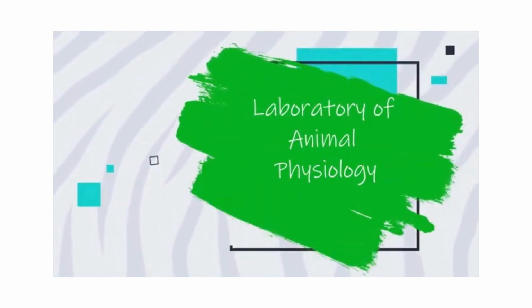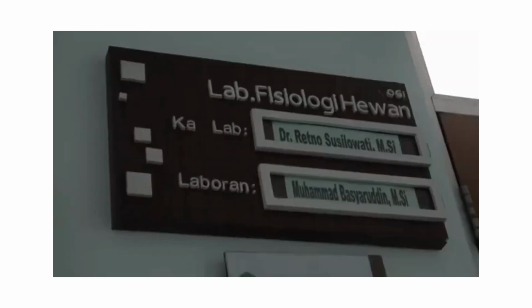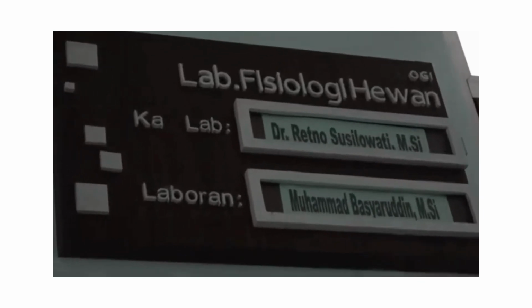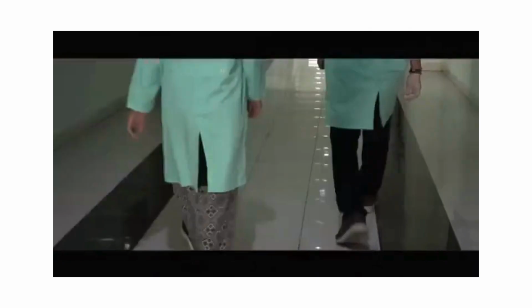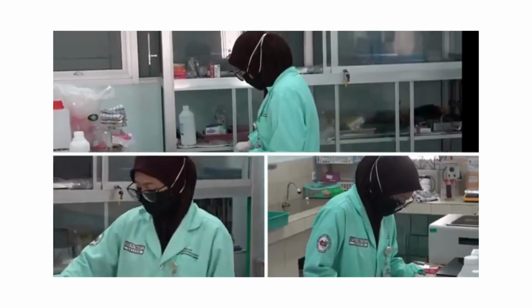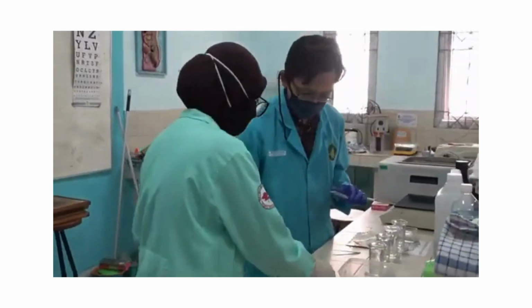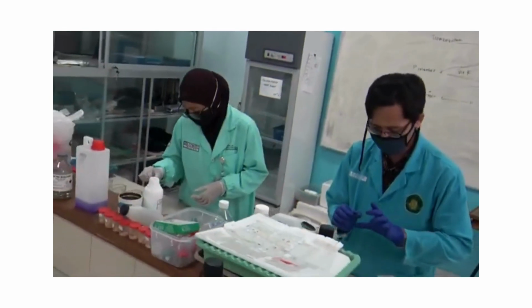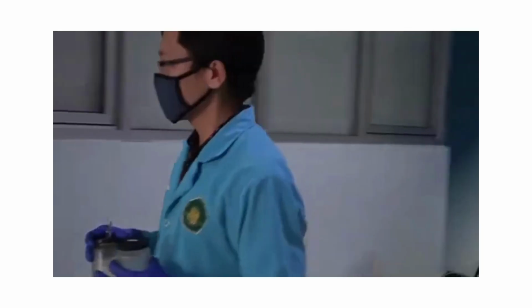Laboratory of Animal Physiology. The Laboratory of Animal Physiology is one of the research laboratories at the biology study program. Experiments using experimental animals are carried out in this laboratory to determine the metabolism and tissue structure of animals. Various natural ingredients are applied in order to see the reaction in the animal's body. This laboratory is supported by several tools such as microscope, blood analyzer, incubator, centrifuge, and other general tools.